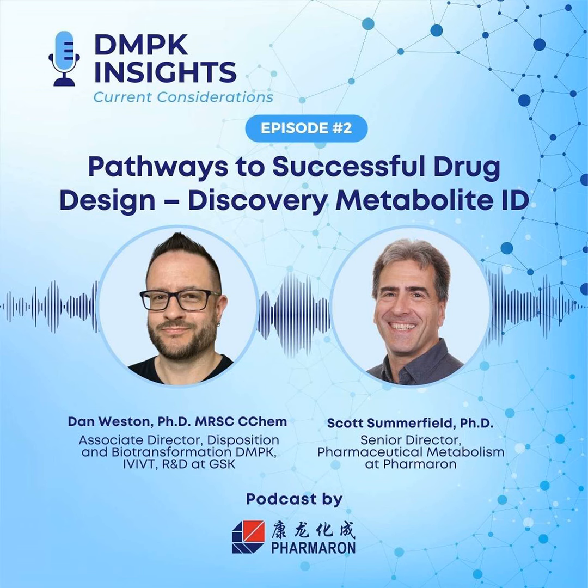But in terms of looking at where we're at now, in what we have to deliver and in what time, not just within discovery at GSK, of course, but as a community, the use of software, as long as it's pragmatic and always has the oversight of a skilled biotransformation scientist, is something that makes a lot of sense.